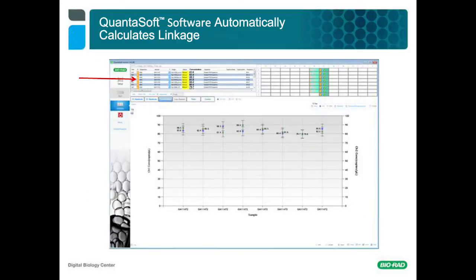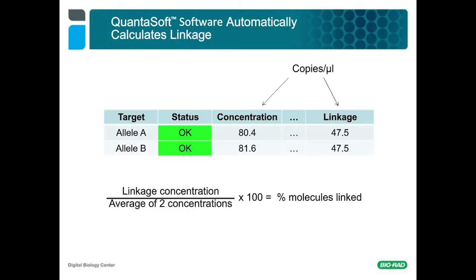Bio-Rad's QX200 Droplet Digital PCR system comes with software called QuantaSoft. Here is a screenshot of one of the data analysis tabs that QuantaSoft automatically populates based on the analyzed droplets. In the upper left-hand corner is a table that includes data from the selected wells. The exportable table has 62 columns of data. Due to the size of this table, I've opted to extract some of the more relevant columns into the table shown here. In one column, I have included ellipses to represent the 15 columns of data that I've omitted for simplicity of viewing.